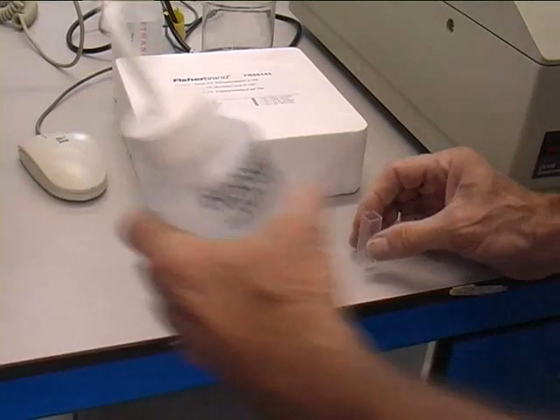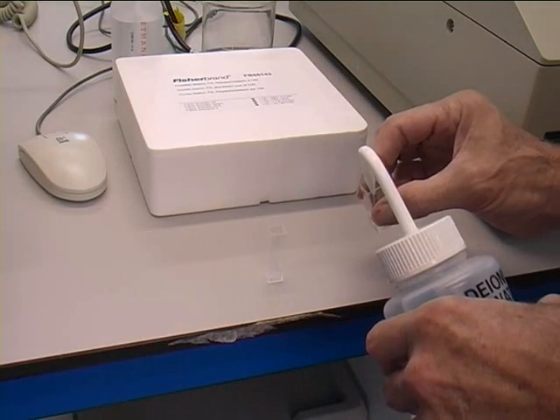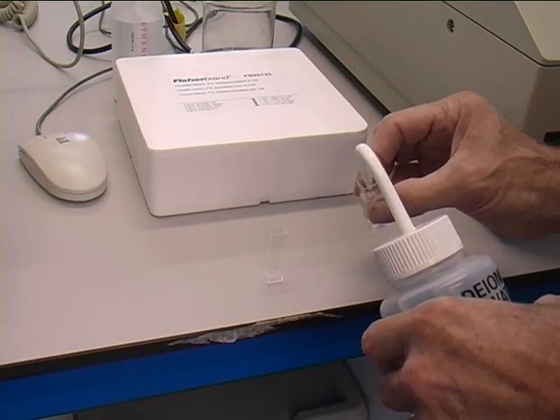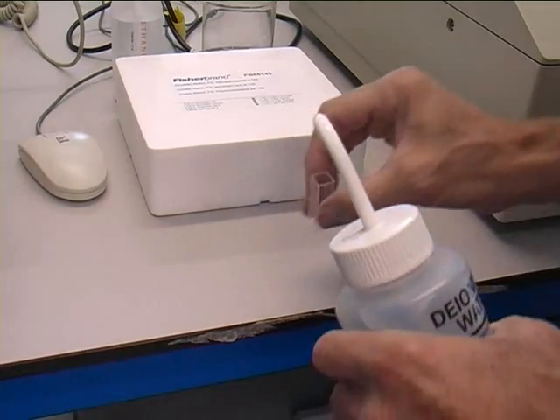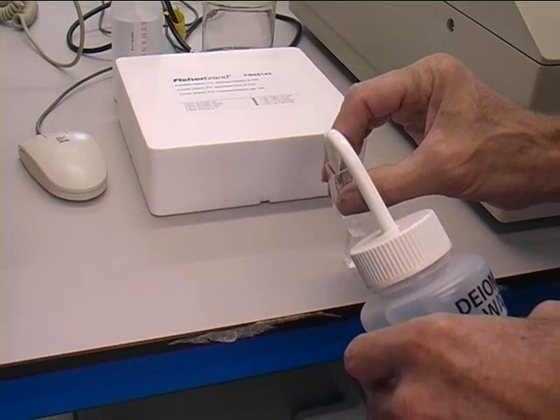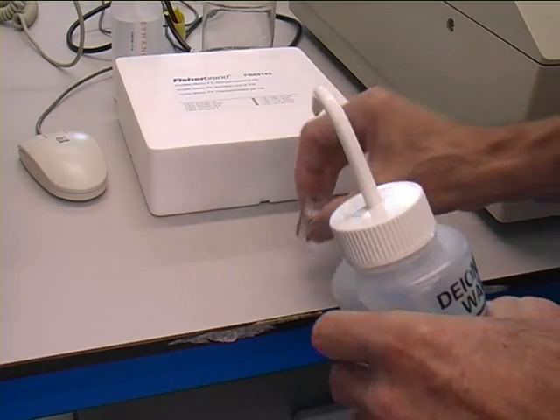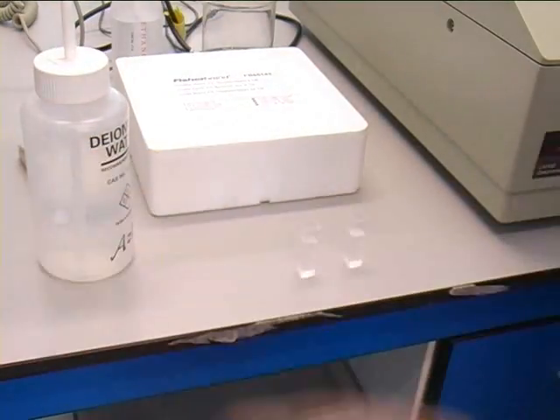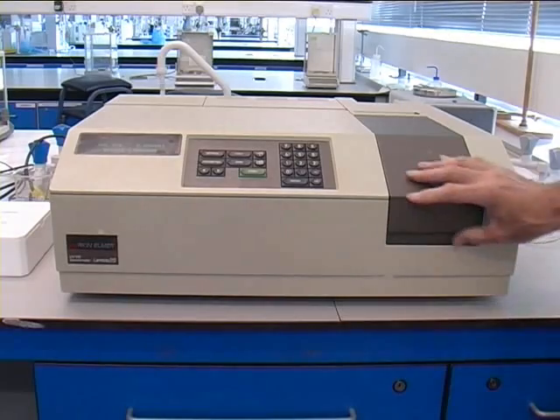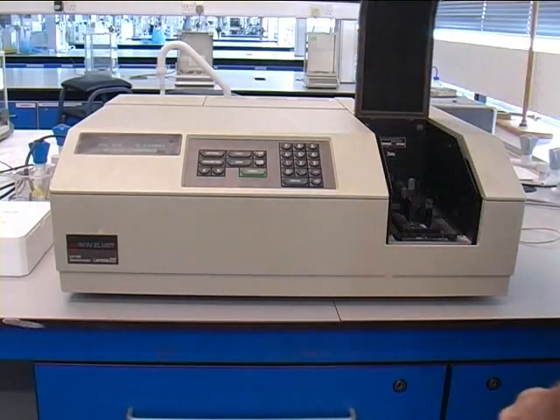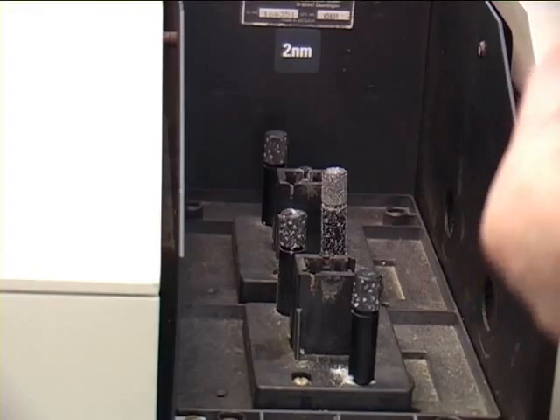First, fill two cuvettes with deionized water. This will be used for a reference. It is important to only touch two sides of the cuvette as the other two sides must be clear for the beam to pass through.